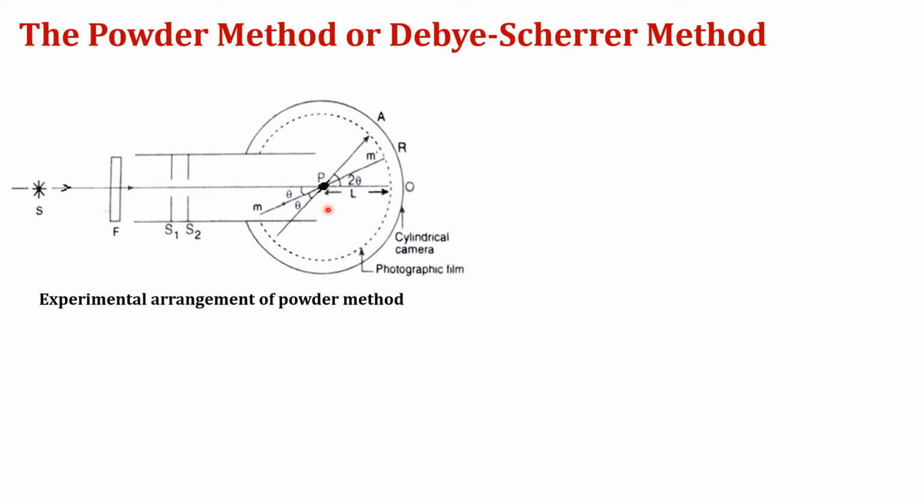Each particle acts as a small crystal grain, or crystallite. In that grain, a certain set of parallel planes gives the resulting diffraction when the plane is correctly oriented to the direction of the incident beam.